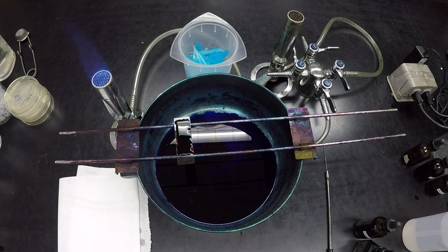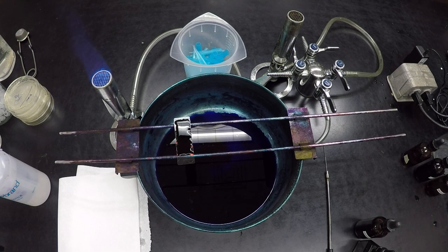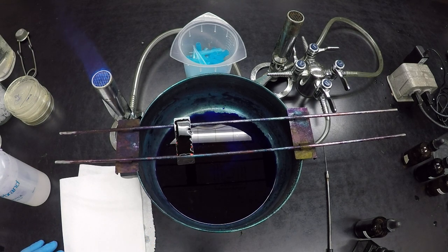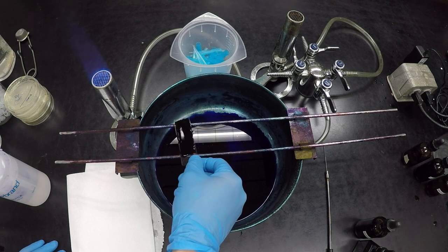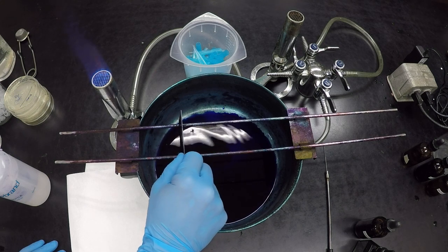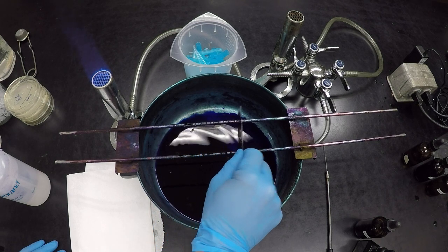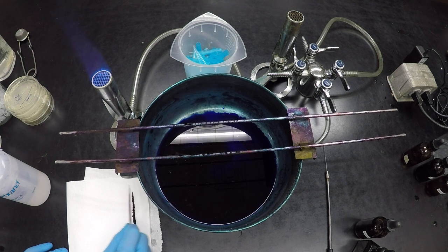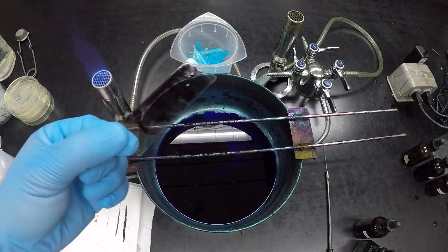Now, I don't like to rinse the slide off in this case, right? Because remember, nothing is heat fixed. You have to be very careful. Because things aren't heat fixed, your cells and everything can wash right off, right? So just be very careful when you're working with this. Typically, all I really do is after it's done, you gently tip, tap it off, touch it to the paper towel, ready for microscope viewing, right?